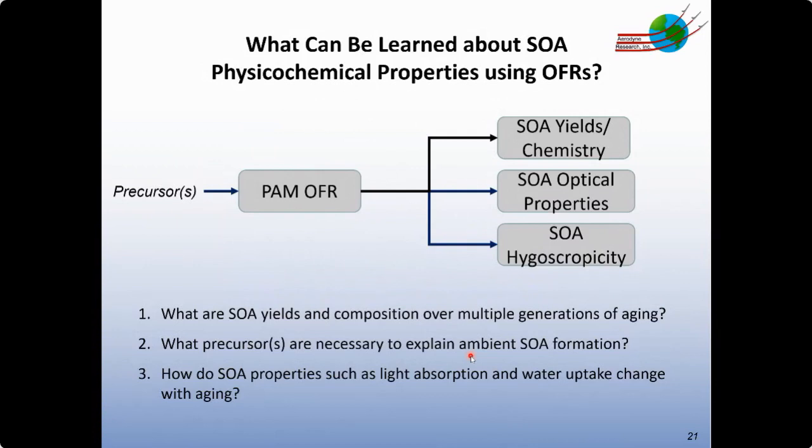So now to switch gears and talk about some other slightly different applications and answer the question, what can be learned about SOA properties using OFRs? Here, I'm going to show some example applications using the OFR in an analogous manner to an environmental chamber, just as a source of different types of SOA, where measurements were made to learn more about their yields and their composition over multiple generations of aging.